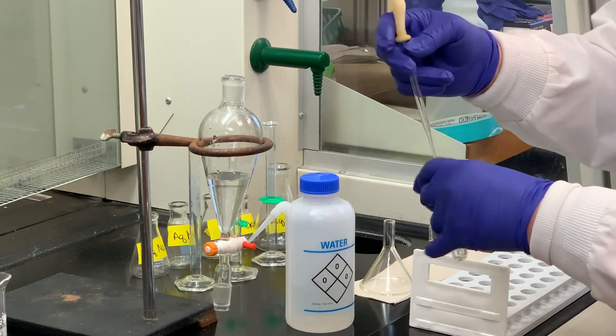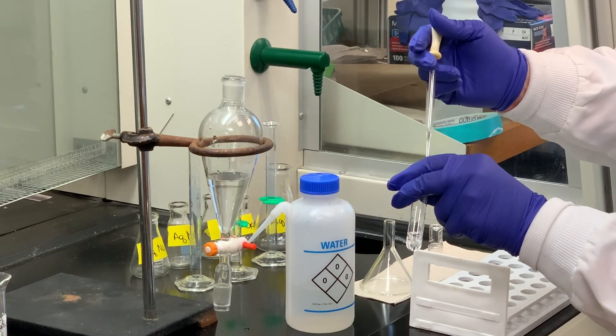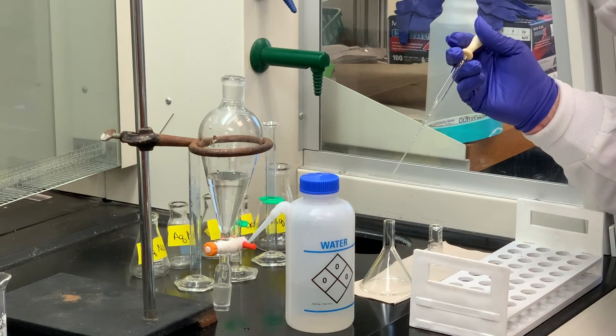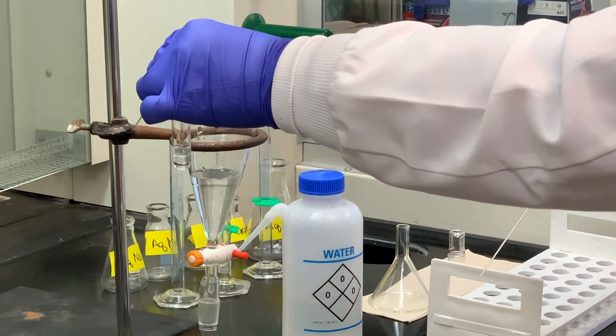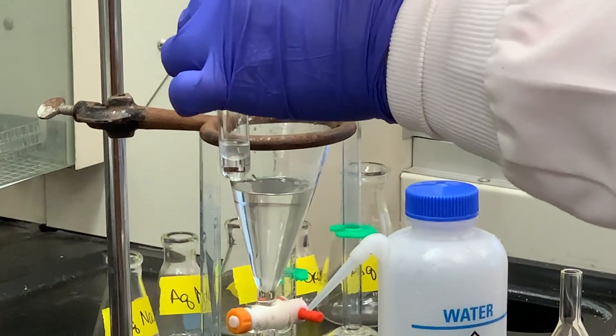And if I see two layers, then that means the top layer cannot be the aqueous, it must be the organic, and you can see that there are two layers. So what does that tell me? That tells me that the top layer is the organic.